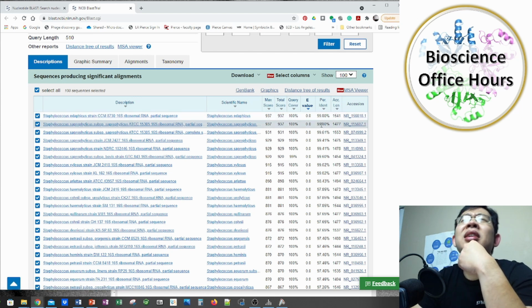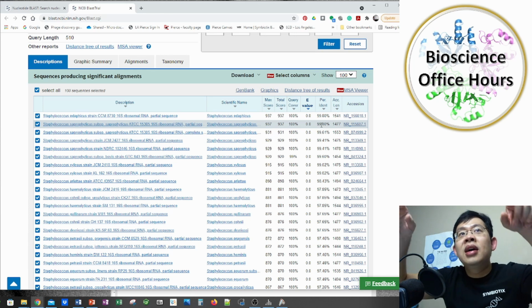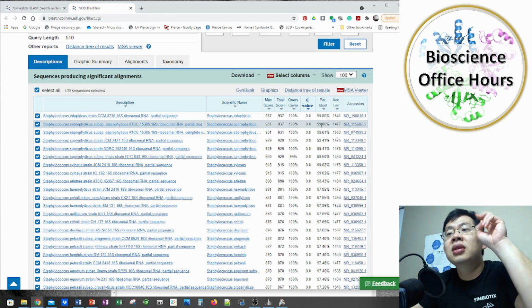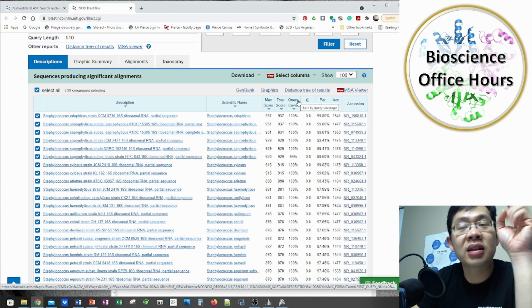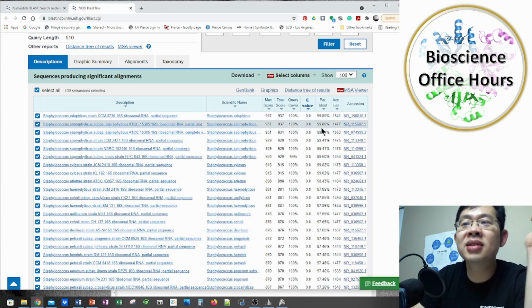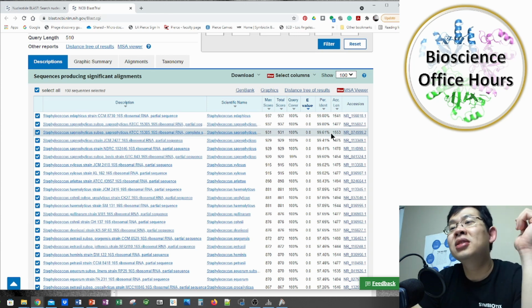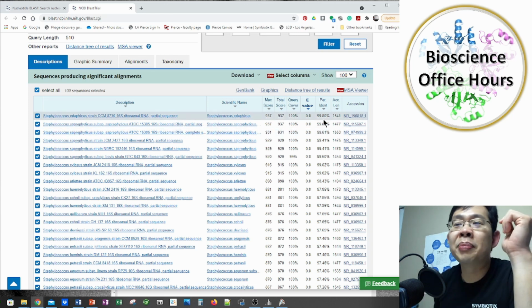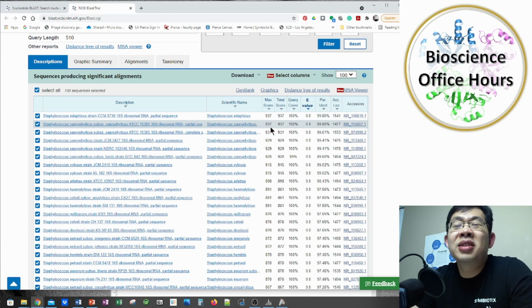The percent identity is, once you align them, say you get 100% coverage within those that you align, what's the percentage of match? If it's 100%, it means all of the letters in the sequence match. If it's 99.8, you may have 1 or 2 mismatches. Things like that happen. It can be because your sequencing resolution is not great. So 100% identity is usually a bit rare. Again, if you look at this, almost everything matches really well.